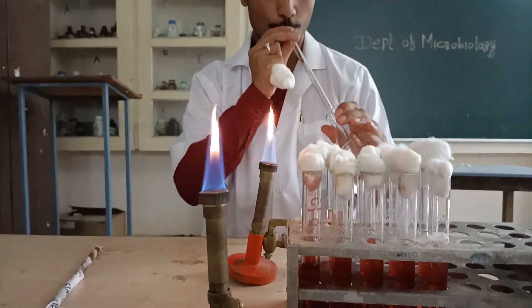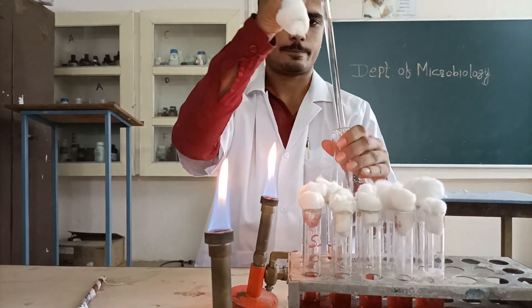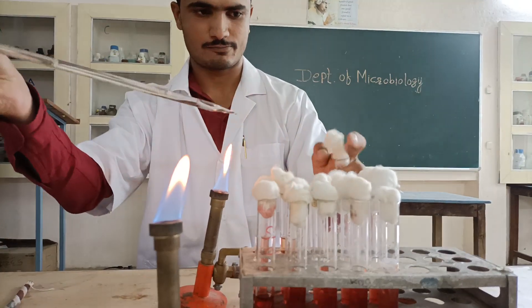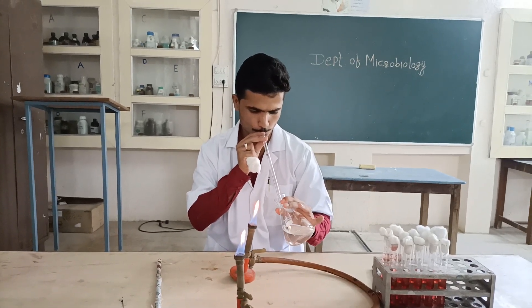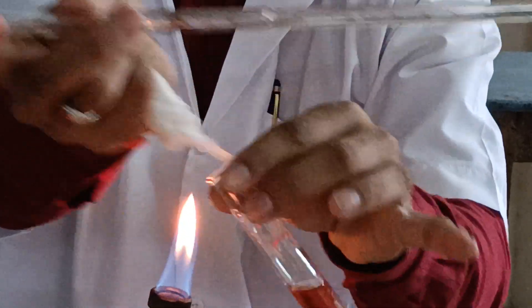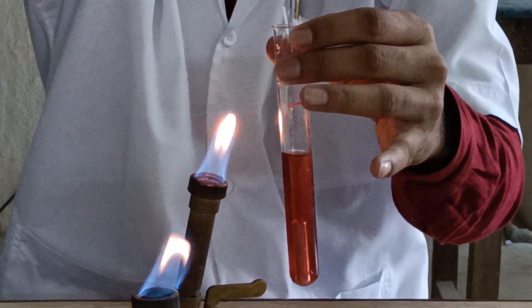Now we have to inoculate 1 ml of the water sample into five single strength test tubes which are inserted with Durham's tubes. 1 ml of water is taken with a sterile pipette and inoculated into the test tubes containing single strength McConkey's broth with Durham's tubes inserted.